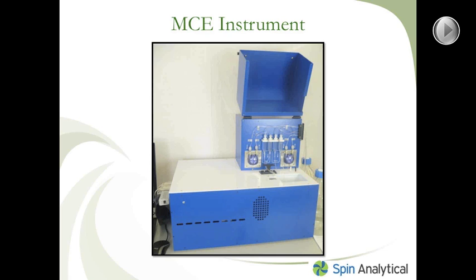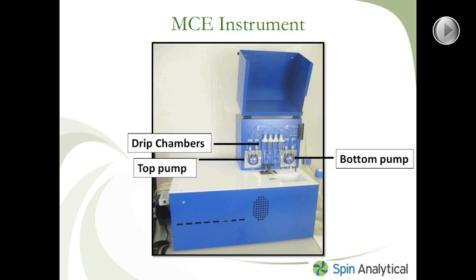Here you can see there are four drip chambers. Buffer is delivered from the buffer reservoirs — it's kind of hard to see in this image, but all the way to the right-hand side of the machine you can see the buffer reservoirs. Buffer is delivered to the drip chambers via peristaltic pumps. There is a top pump and a bottom pump. The top pump delivers buffer to the top buffer chamber of your cell assembly, while the bottom pump delivers buffer to the bottom buffer chamber.